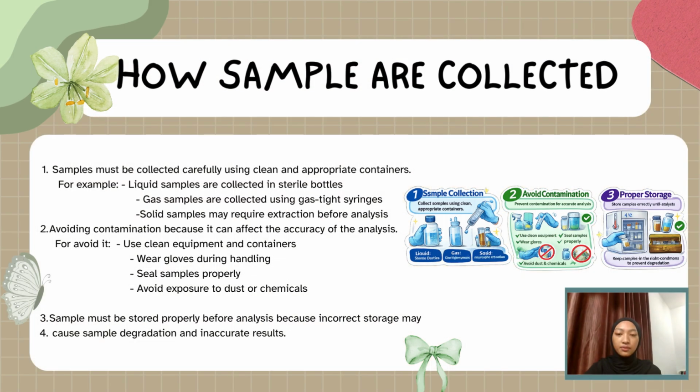Before chromatography analysis, a proper sampling procedure is very important to ensure accurate results. Samples must be collected carefully using clean and suitable containers. For example, liquid samples are collected in sterile bottles, gas samples in gas-tight syringes, and a solid sample may require extraction before analysis.